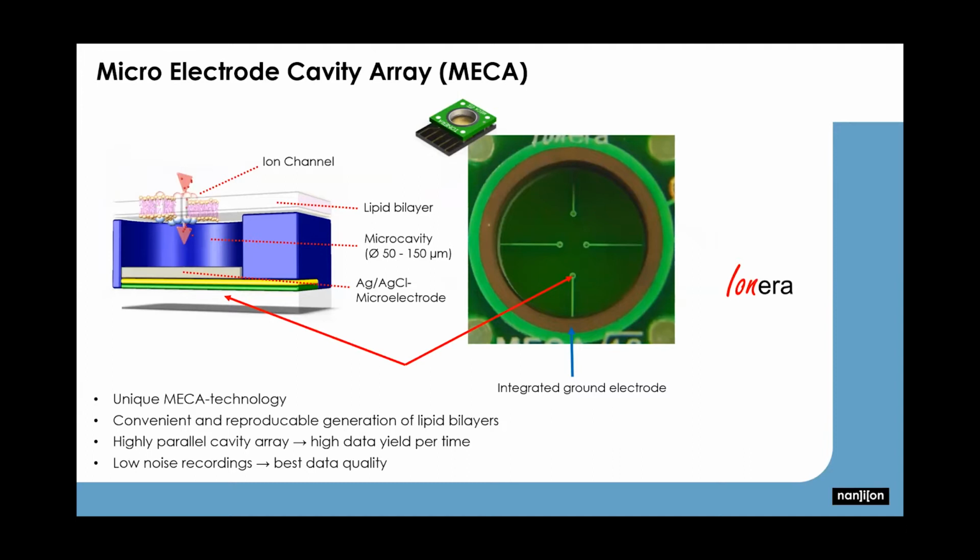And on the surface of these chips, you would find cylindrical cavities that you would basically span with a lipid bilayer. I will show on the next slide how this is actually done. And the bottom of these cavities would be the driven electrode for each channel. And they share a common ground electrode, which is the rim of the chip. And of note, the chip is its own recording chamber. So for one target, you could use one chip and never have to deal with cross-contamination. These chips can be used several times for several experiments, and they are very robust and easy to clean.